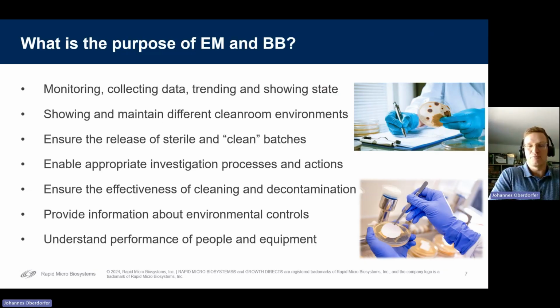Otherwise it would be a black box, and we would always be hunting down something, not knowing where the contamination came from, constantly trying to find it. But at the end, the EM and bioburden programs ensure that we know holistically what happens in our facilities.